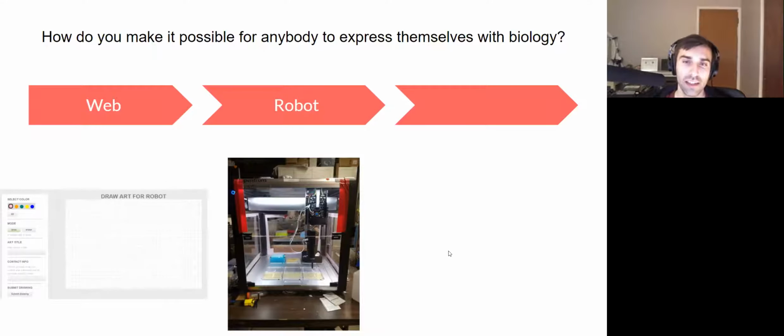There are ways that you can take BioArtBot and expand it from there. So you can say, okay, I want to do big broad strokes. So I have to think about the robotics. How do the robotics work and how do we actually apply microbes onto the ground? Or maybe, all right, I just want to upload Starry Night to a website and I want it to be grown in microbes. Sure. Okay, well, that's a software engineering problem. How do we think about that?